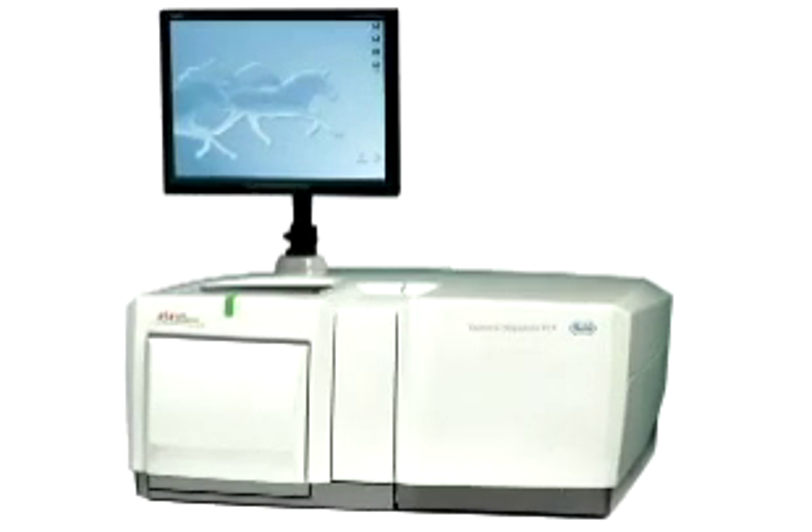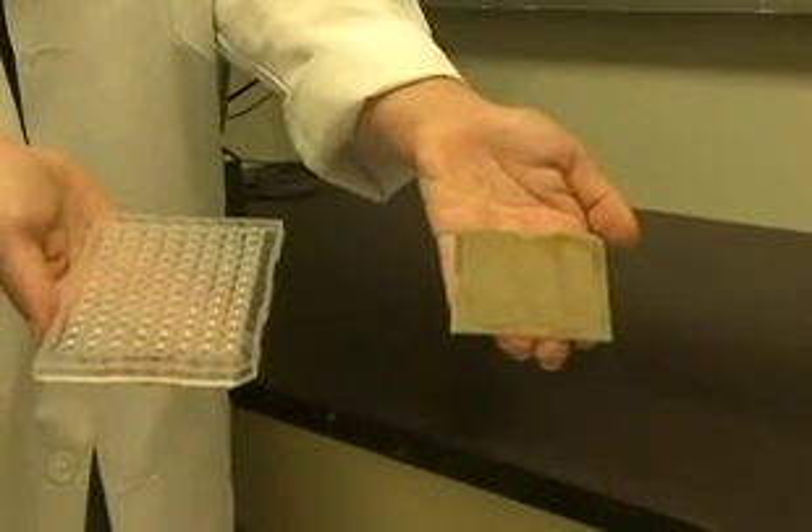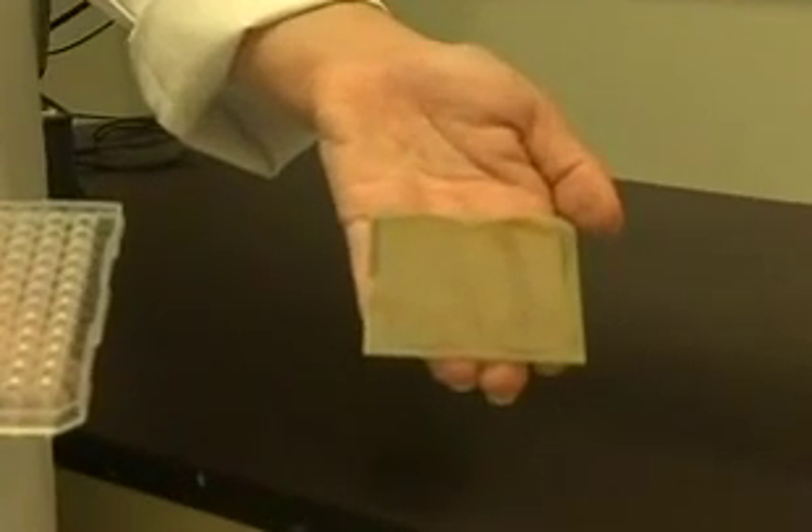The next step occurs in the 454 machine. First, we take the beads and run them over a picotiter plate. Picotiter plates are much like microtiter plates, but there are several million smaller wells created by etching a glass slide.